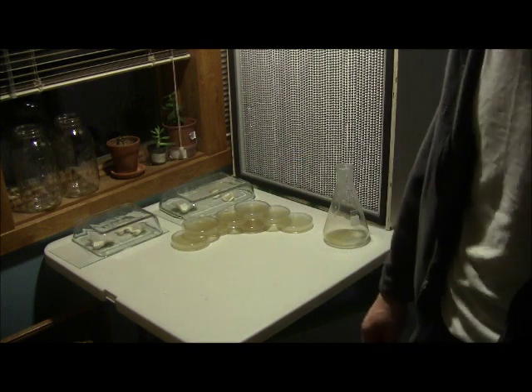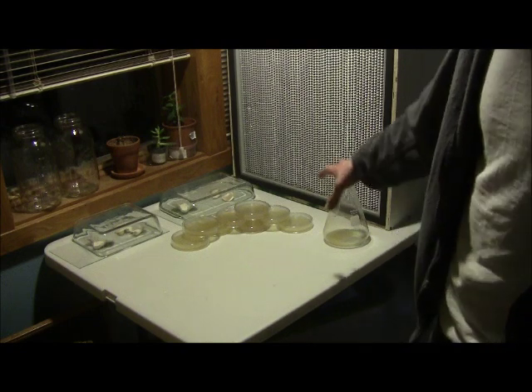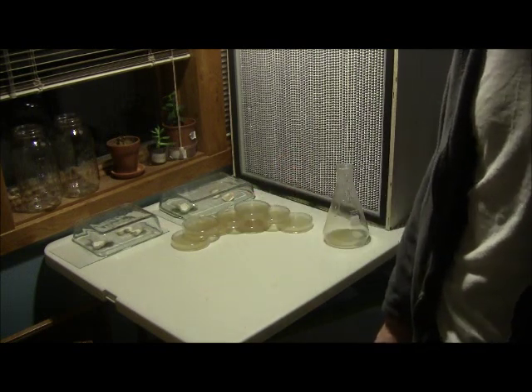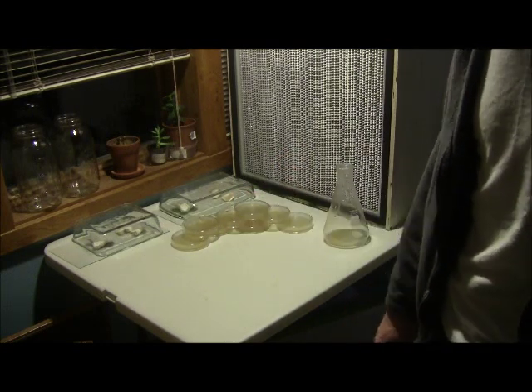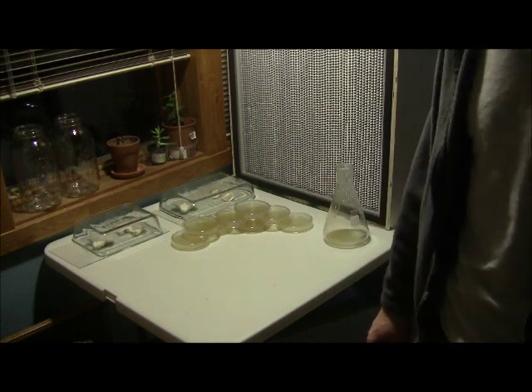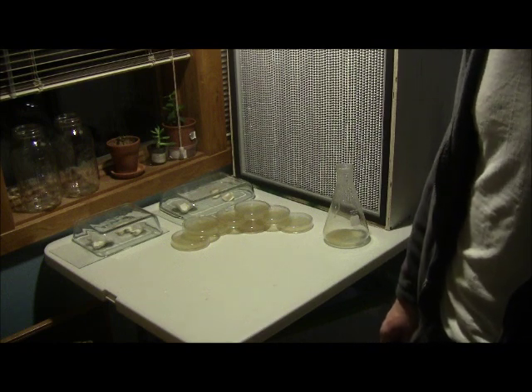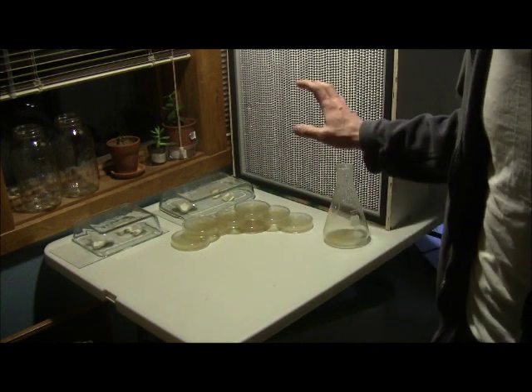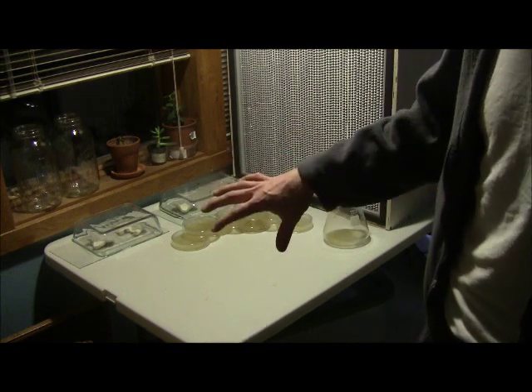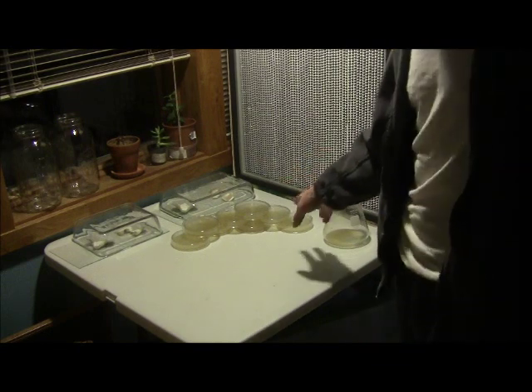You can also do spore prints — take myceliated petries, blend them up using certain lab blenders to make a slurry, then make syringes that way. But for the most part that's a lot of extra work. I prefer to just do direct transfer from petri to grain, and it works out really well.